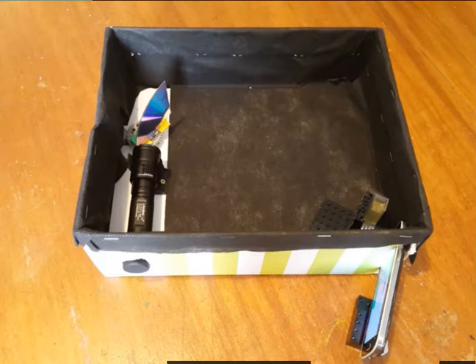These are all components that are important parts of a spectrophotometer. If you don't know what a spectrophotometer is you can read about it elsewhere, but it's an important piece of lab equipment that can be used to determine the concentration of molecules in solution.